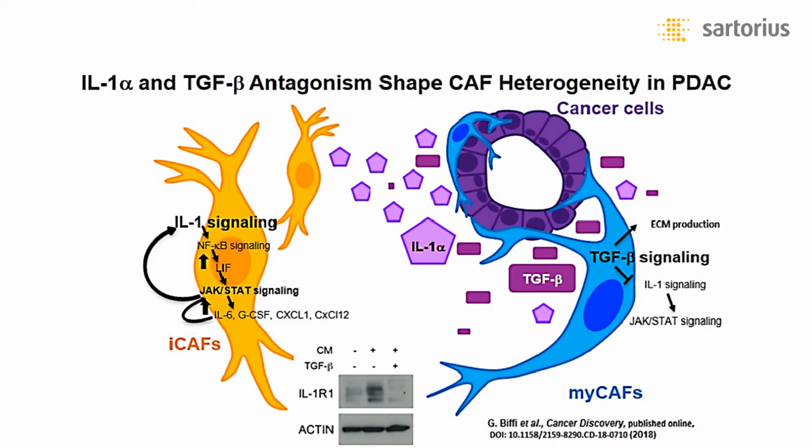This is totally antagonized by the presence of active TGF-beta in the culture. And so she published a very nice paper that was cause and effect, genetics, and cell biology and biochemistry, all allowed by the fact that we had this in vitro surrogate system based on organoids co-culturing it with mesenchymal cells.